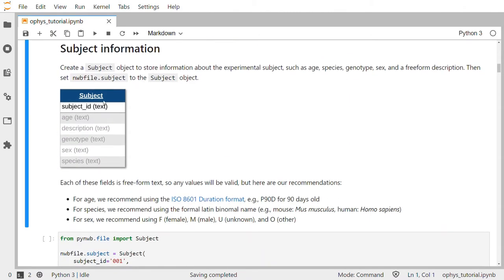Now let's create a subject object to store information about the experimental subject, such as the animal's age, species, genotype, sex, and a free-form description about the subject. You can see here a class diagram depicting the subject class. The field subject ID is a text field that's required, and the other five fields are optional. Each of these fields is free-form text, so any values will be valid, but we have some specific recommendations.